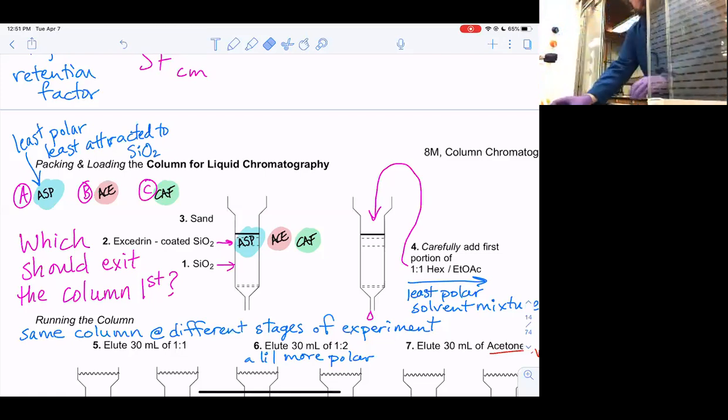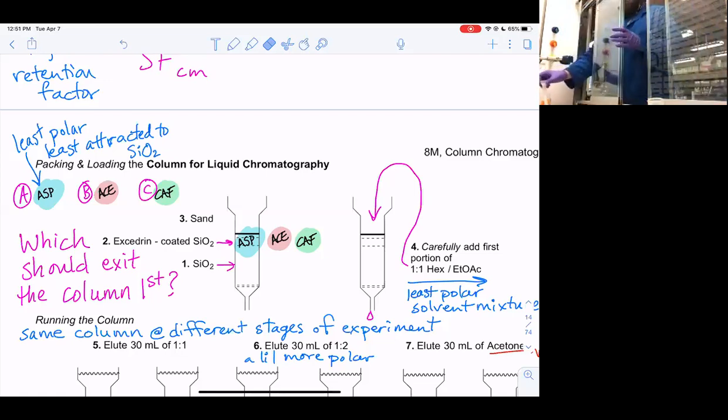So you need to go back or forward? Yep, that's about as good as I can do, because otherwise I'm too close to the edge of the hood. Nope, 6 inches inside, right? Oh, so it's going to be like that, huh?